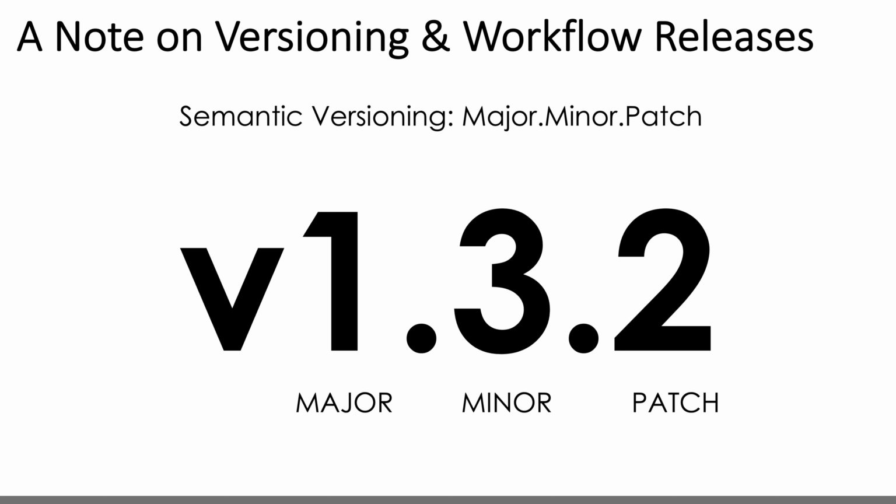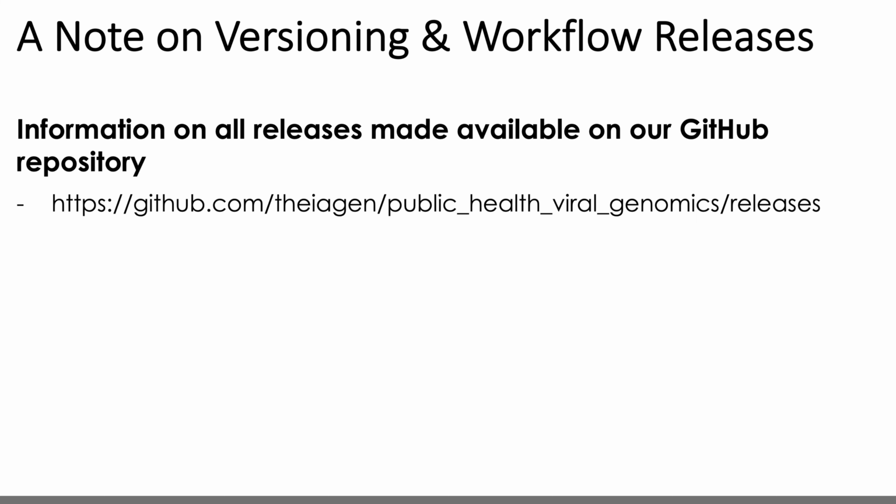So as you all know, SARS-CoV-2 bioinformatics is a wildly dynamic field in public health right now. So in turn, we have been dynamically developing and releasing updated versions of our workflows, and will continue to do so as we further optimize these solutions. So if you see a new version available on your Terra workspace and are curious to learn more about each update, we make that information publicly available on our GitHub page here.